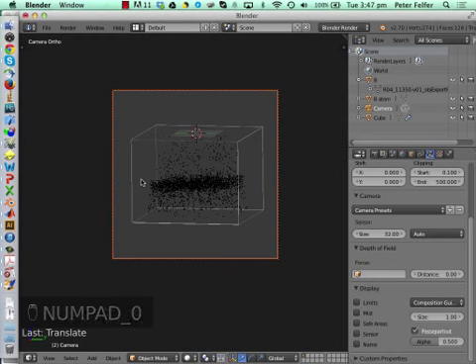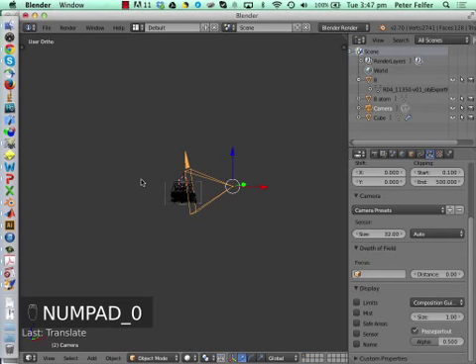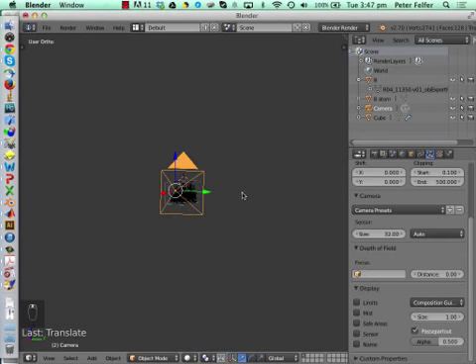And we're going to do it the complete way. So I'm going to show you how to set up a rig for that, just because that's the proper way of doing it, and it gives you full control of animations. What that means is we're going to have a target for the camera, and we're going to move the target for the camera rather than the camera itself.